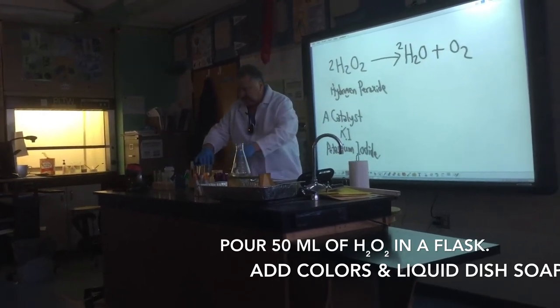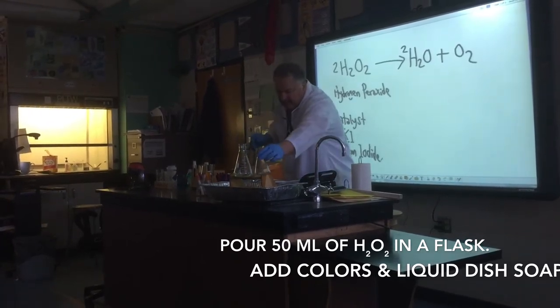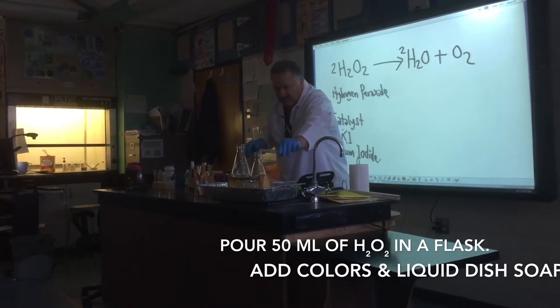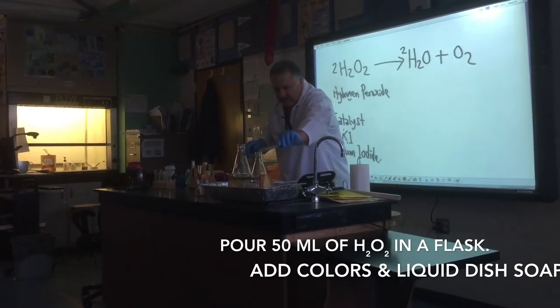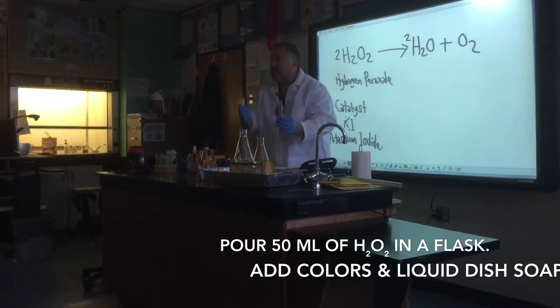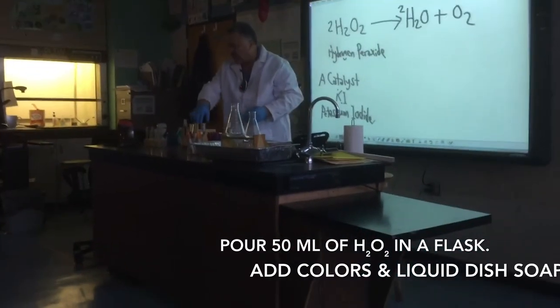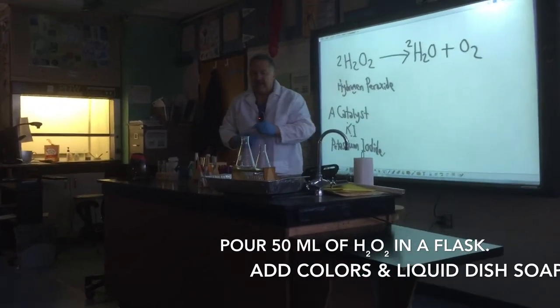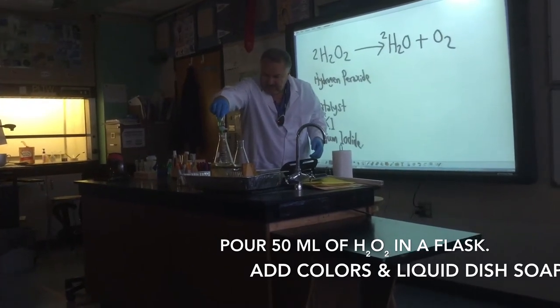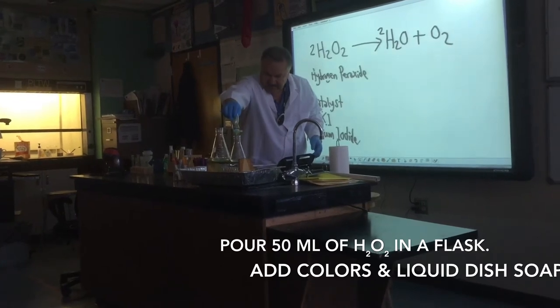Let's do two at the same time, because you're a good group. I didn't do that for the other group. Okay, hold on. We're going to put the other one here. That's hydrogen peroxide as well. So you have a flask, a large one and a small one. Now, I'm going to add some soap over here, and some here.